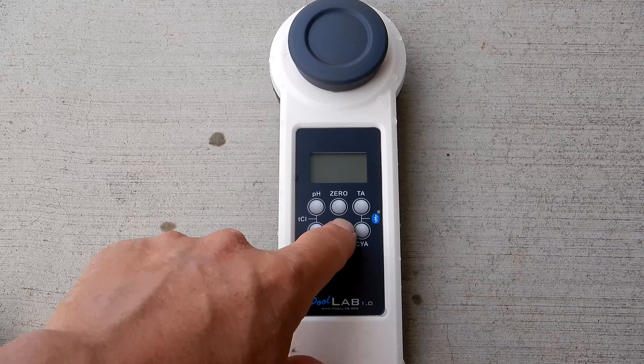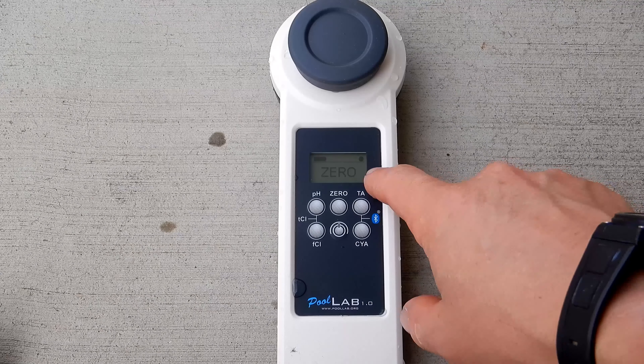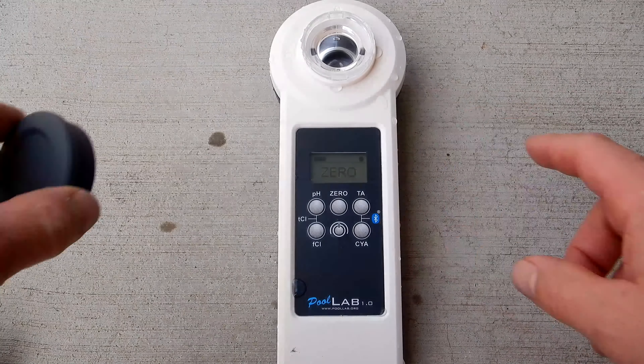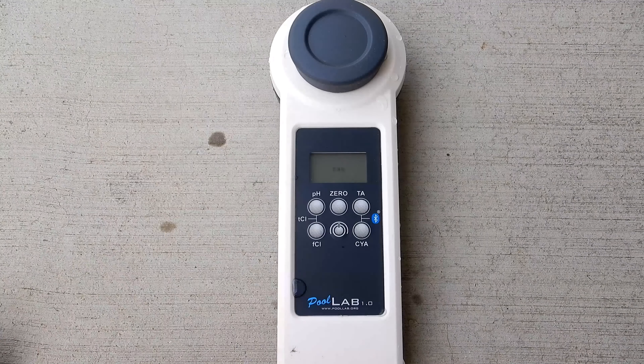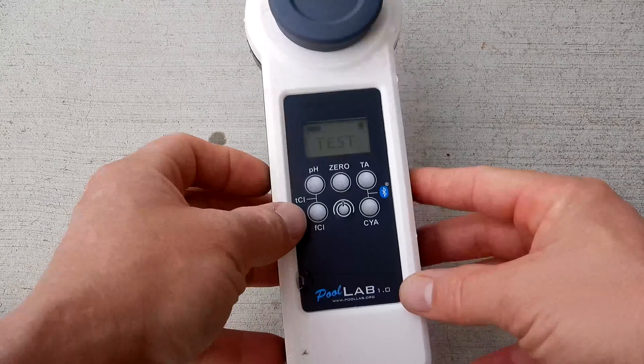Turn on the power to the unit by holding the button down in the center. Then you want to get a zero, which is the water sample in here without any of the tablets or reagents. Go ahead and hit the zero button. It'll let you know that it's ready for testing — it'll say 'test' on the screen.